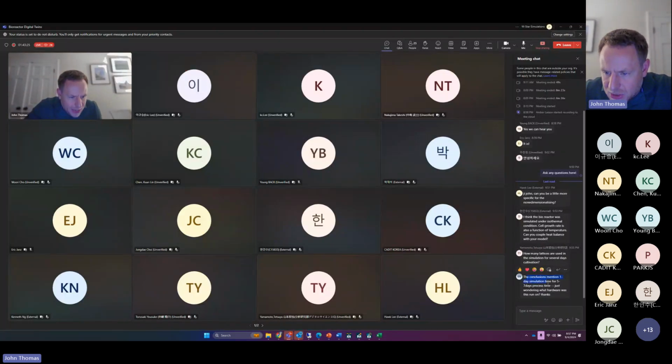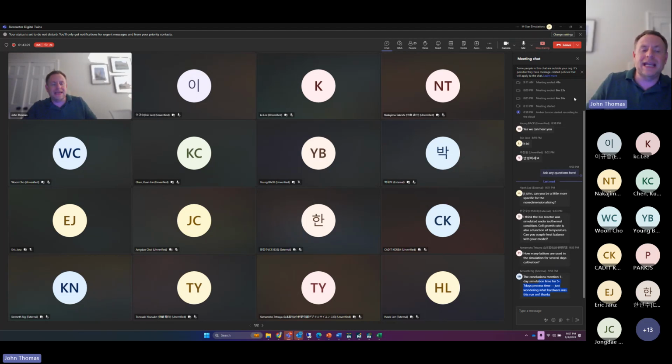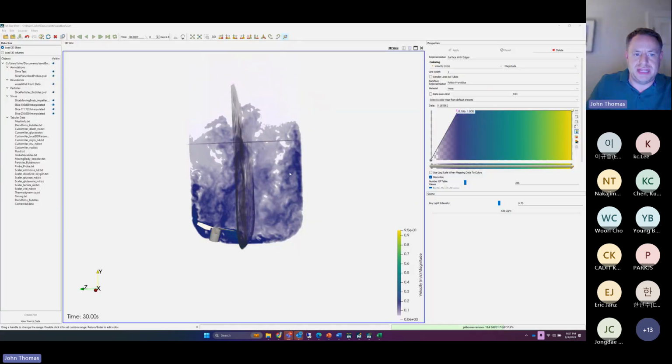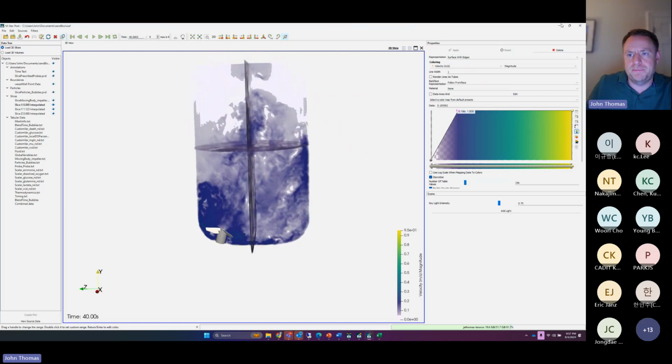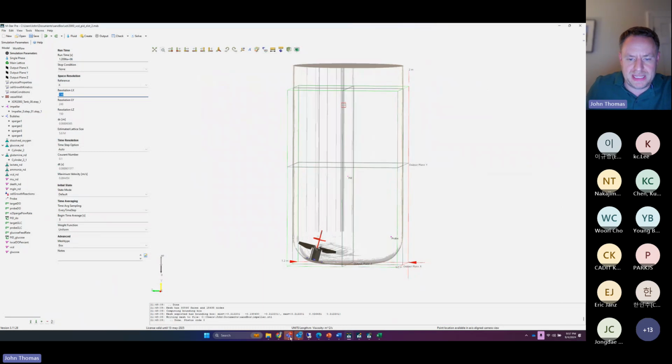Yes, this is correct, Kenneth. And again, I'd be happy to send you the models that achieve that. This one here is cranking along, but I'd be happy to send those models and show some of that scaling performance.